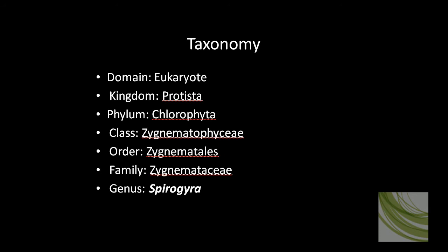This is a slide of a common green algae called Spirogyra. Here is the taxonomy of Spirogyra. It is in the domain Eukaryota, which means a true membrane-bound nucleus, kingdom Protist. Its genus is Spirogyra.